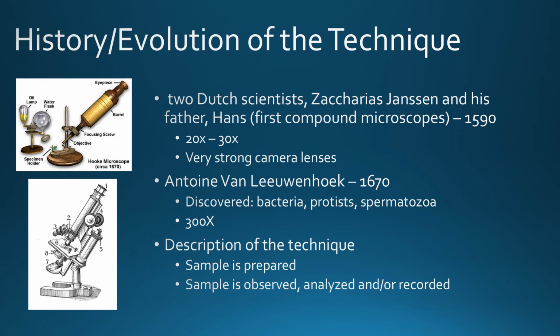Back then, probably through drawing pictures primarily. Now we can take pictures and do more advanced things with the specimen. But you obtain the specimen, you prepare the specimen, and then you observe the specimen.